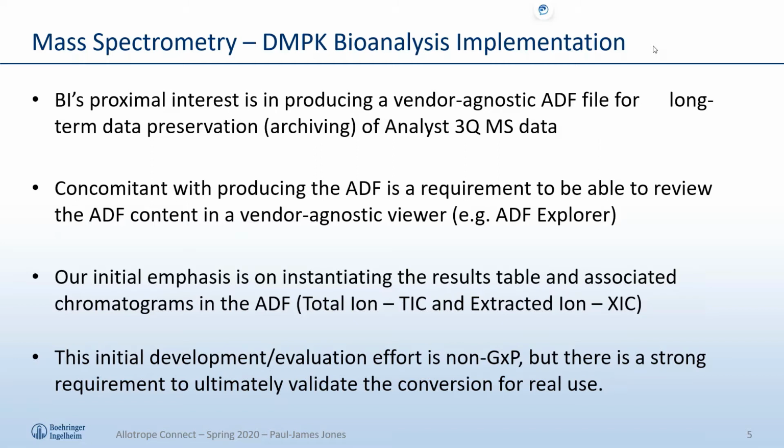Our initial emphasis is on instantiating the results table and the associated chromatograms, the TIC and the XIC, in the ADF. Now, this initial development or evaluation effort is non-GxP, but there's a strong requirement internally to ultimately validate this conversion for real use. Next slide, please.